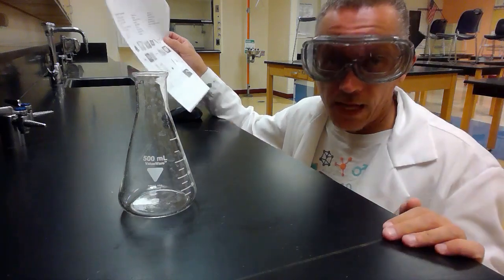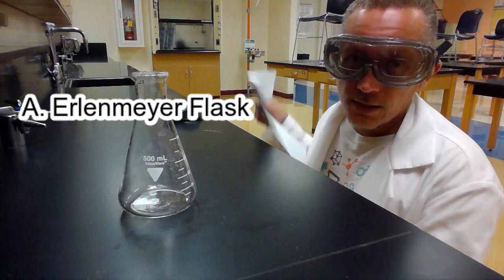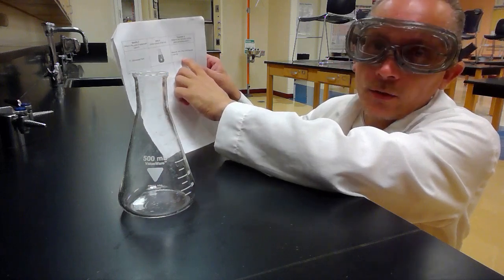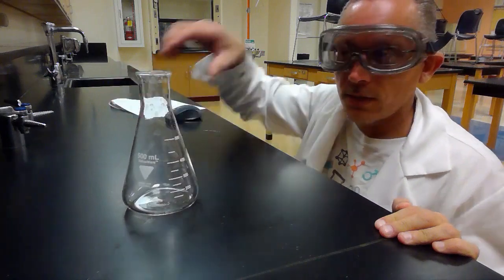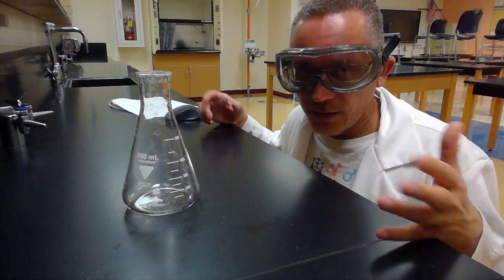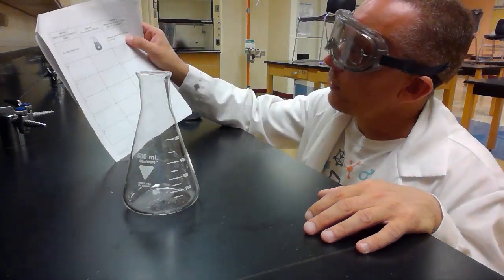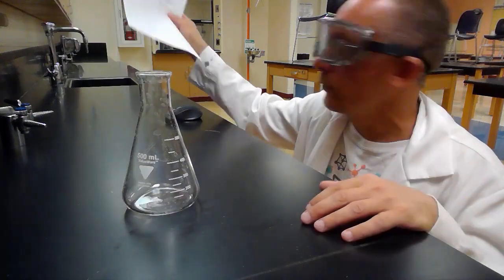But the first one, picture A, you can see here, this is what's called an Erlenmeyer flask, right? And you can see on there, the first one is done for you. So A is the Erlenmeyer flask, and then you can see a picture of it there. And then what is it used for? We talked about in the last video, we talked about a flask. We can use it to hold our chemicals. We can use it to mix some things together, to have them react. We can use it for several different things. And if you look on what's done for you, it says we can use this to measure, mix, and hold liquids in the lab, right?